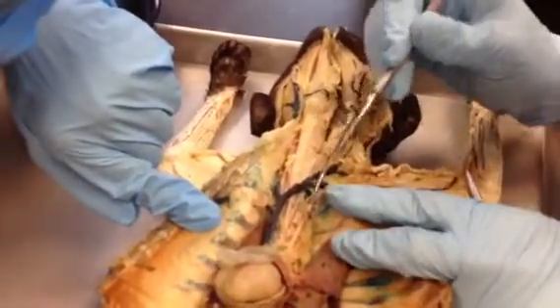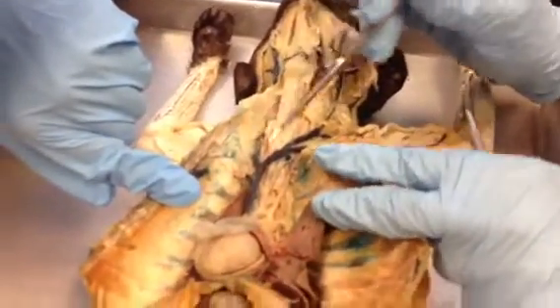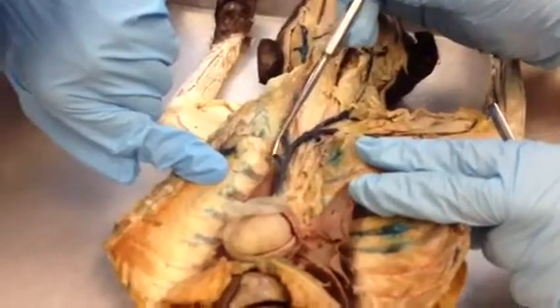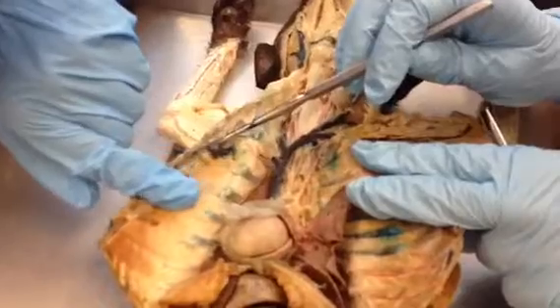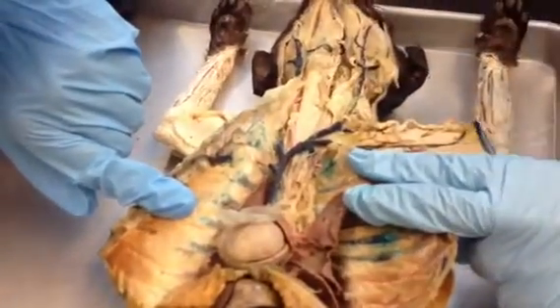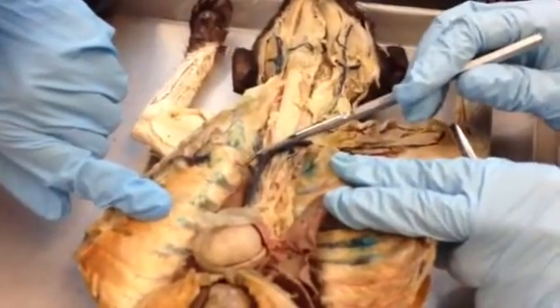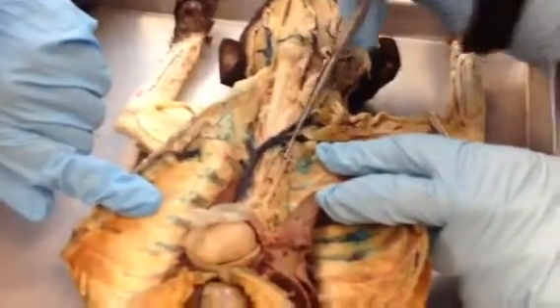Okay. The first branch, and it's severed on this side as well as on here, but what you will see is the branch is sticking straight up and going into the sternum. In here, this is where it connected before, so you would just see that connection. It's the only one that sticks straight up and goes into the sternum. And that's called the internal thoracic artery. Then the three smaller branches.